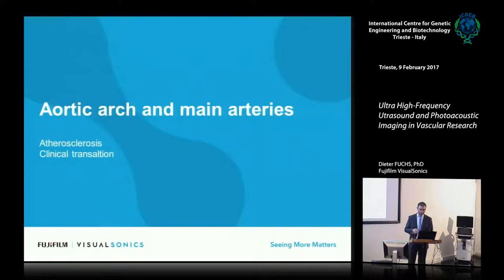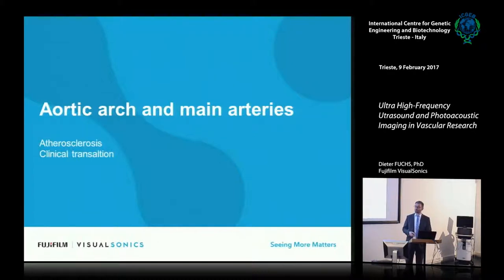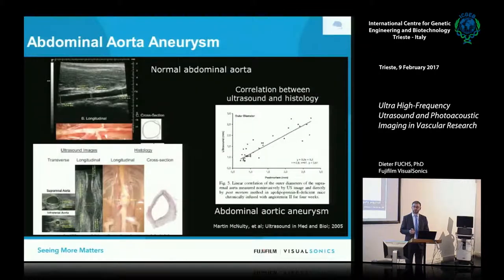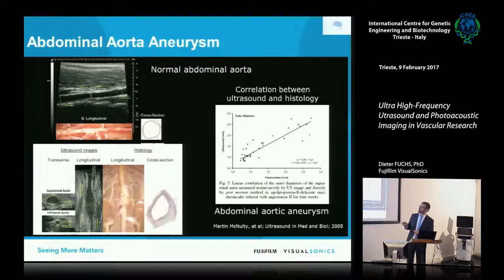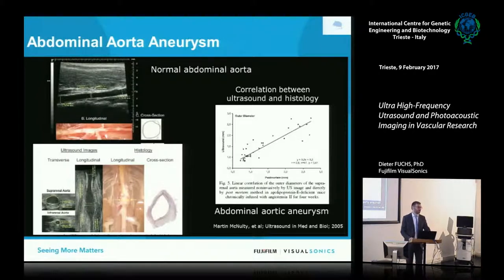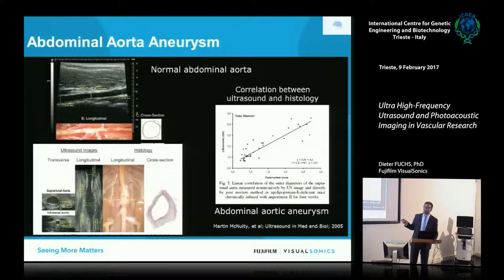Moving a little further away from the heart to the main arteries — I don't know if any of you works with induced aneurysms. You can look at them in 2D and 3D, assess the diameter of the abdominal artery in the longitudinal section, look at the aneurysm, assess its volume, and the nice part is that it correlates very well to what you can do ex vivo.